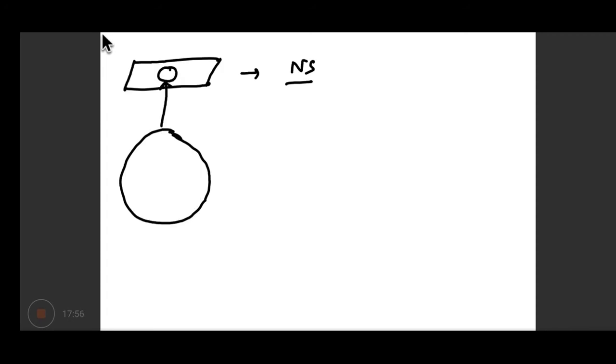So we have taken a glass slide. We take a drop of normal saline on this. We take the colony now from the culture plate. अब मेरे पास ऐसे बहुत सारी colonies हैं, ठीक है? So many colonies I have separated. We pick one part of the colony with a very thin straight wire. We pick only a part of the colony and we emulsify it in normal saline that we've taken on the slide. ठीक है, तो बन जाता है एक smear. This smear is allowed to air dry.